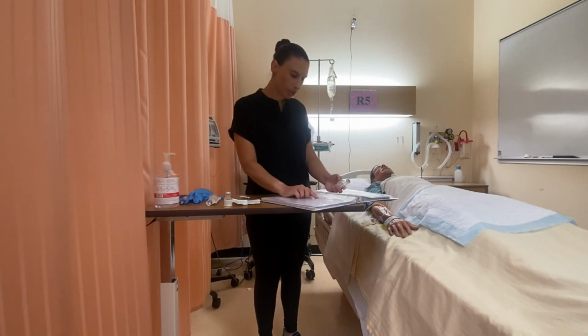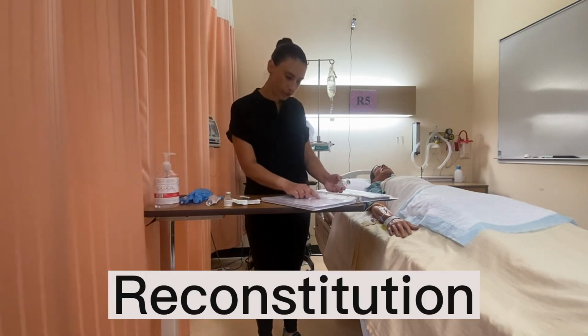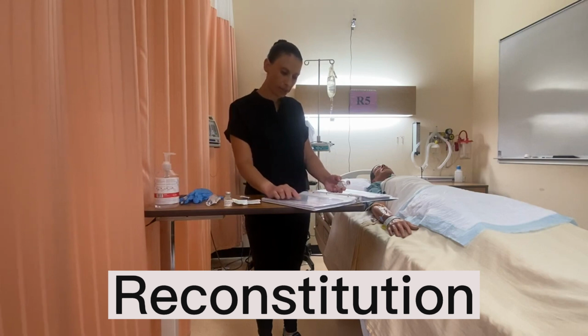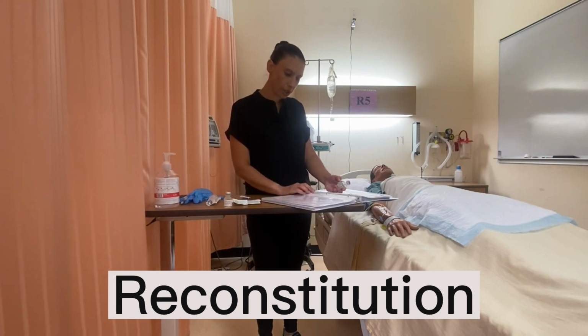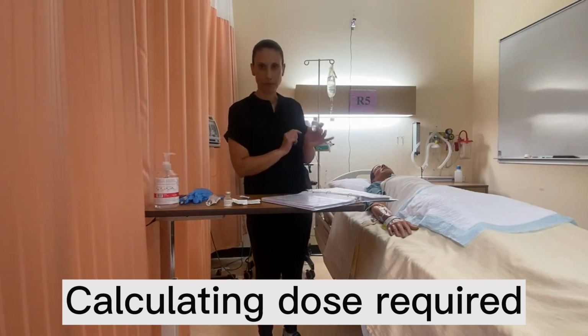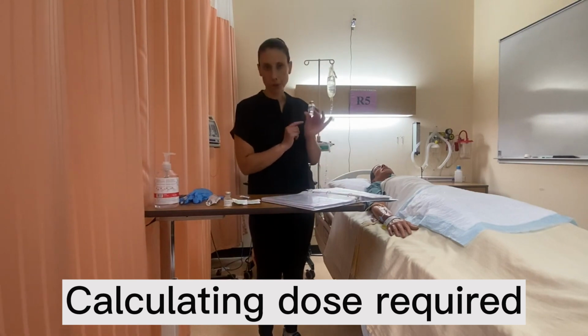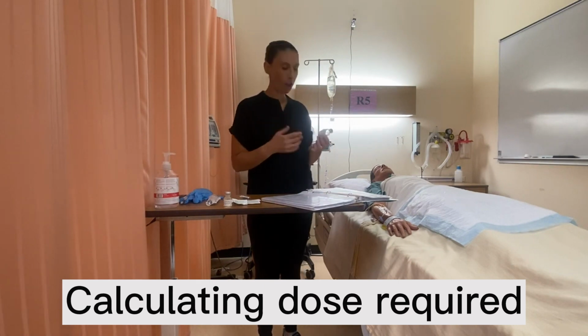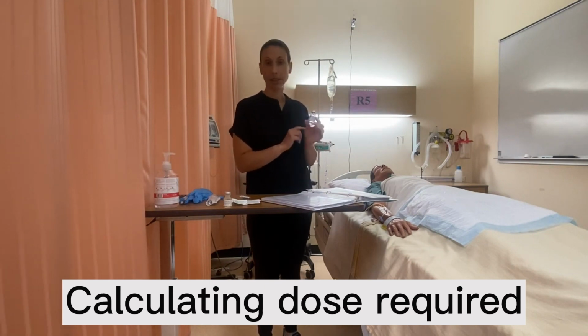So I would also look to see how I'm going to mix this medication. And I can see 500 milligrams. I'm going to add sterile water, 10 mls, and it'll give me a final concentration. And since my dosage is 500 milligrams and this is a 500 milligram vial, I know I can get my full dosage from here. Okay. If I had a 1 gram vial, I wouldn't need the whole vial. I would only need half.